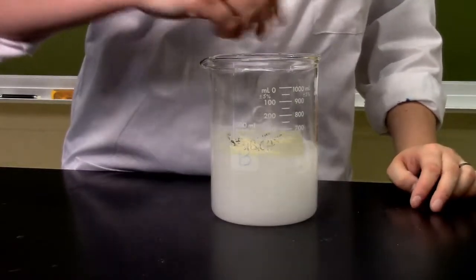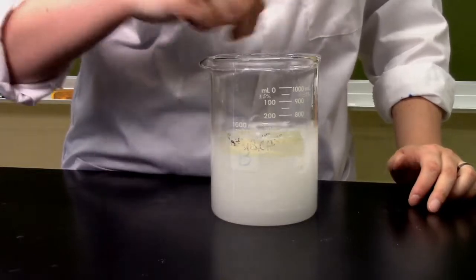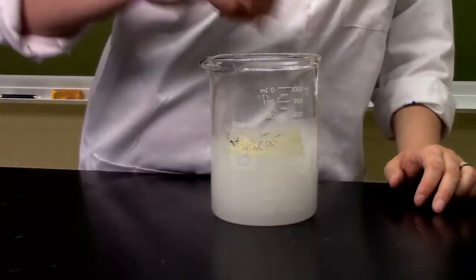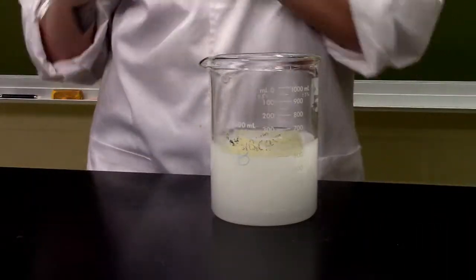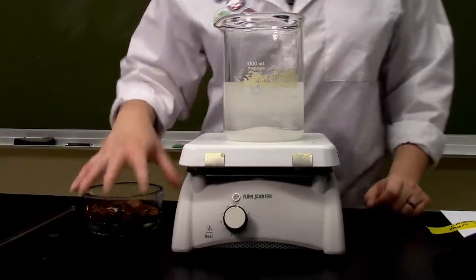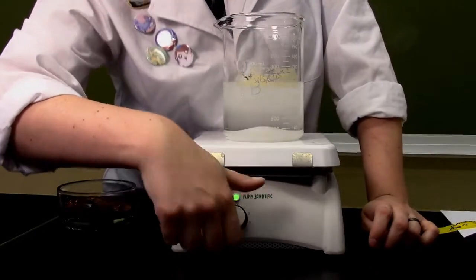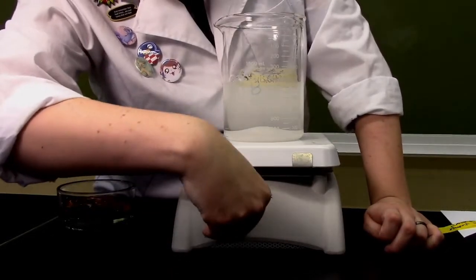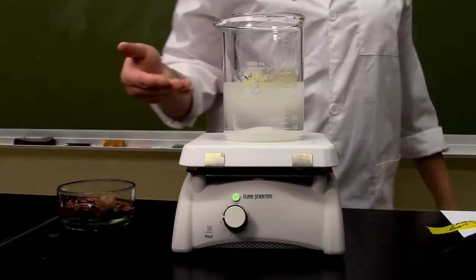Here we go. I've added the 100 grams of sodium chloride and the 500 milliliters of vinegar. Smells like salad dressing. Let's get this on our hot plate. My hot plate is plugged in, so let's turn the temperature on. So I'm going to set it to about medium high, so this goes to a scale of 10. So I'm setting it to about 8 here.